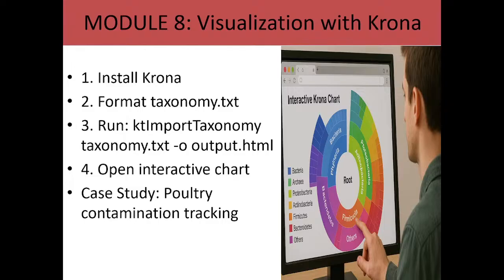Apart from that, you run it on your system. After installation, you format the output. It's not going to be in form of FASTA.